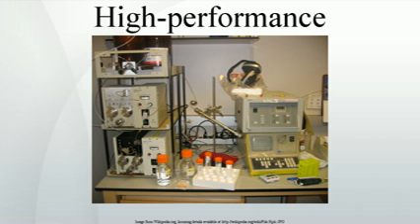Ammonium formate is commonly added in mass spectrometry to improve detection of certain analytes by the formation of analyte ammonium adducts. A volatile organic acid such as acetic acid, or most commonly formic acid, is often added to the mobile phase if mass spectrometry is used to analyze the column effluent.